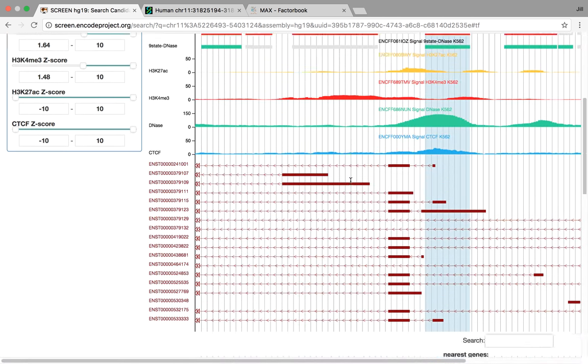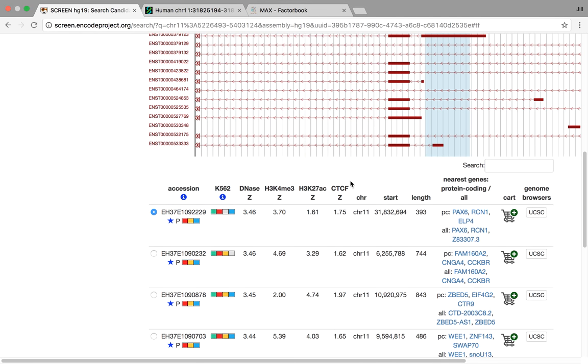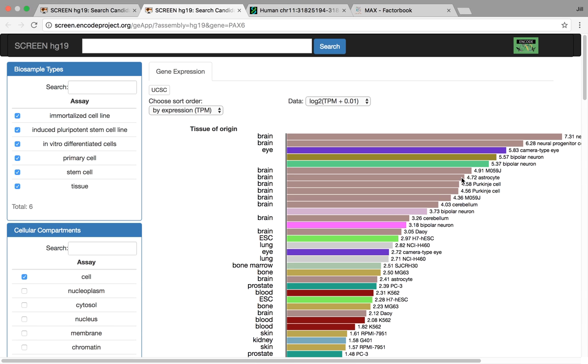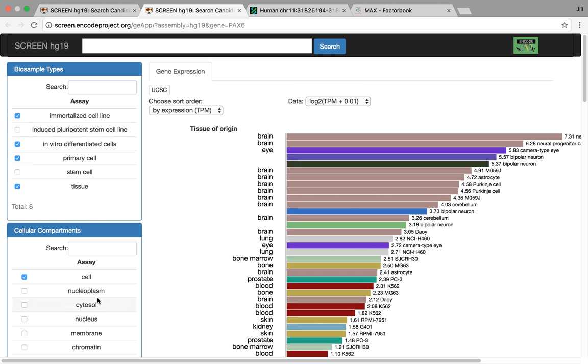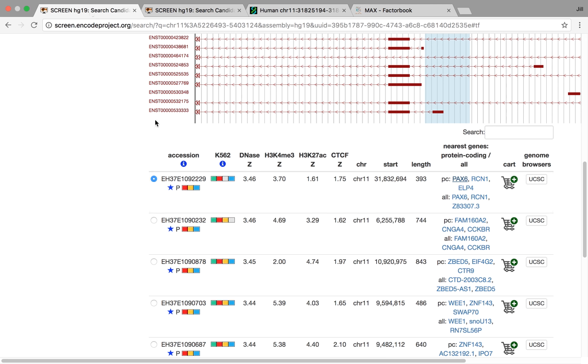So that's most of that for the CRE search application. We have a few other things though in SCREEN. One of them is a separate gene expression app, similar to what you've seen before in the CRE details page. However, you also can start to filter down on the biosample types as well as whatever particular subcellular compartments you like.